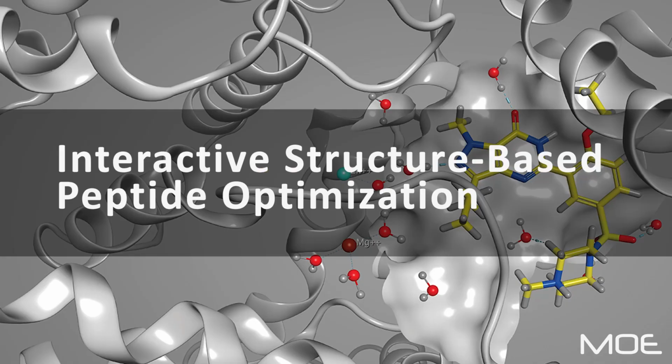Today I'd like to show you how to analyse a protein-peptide complex, and we'll do that by looking at key interactions and hotspots. Then I'll show you how we can use that information to optimise the design of our peptide. So let's get started.